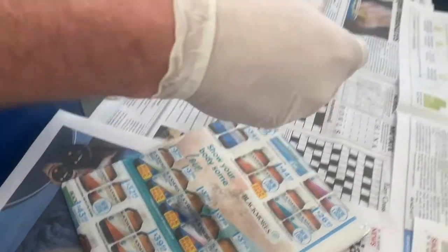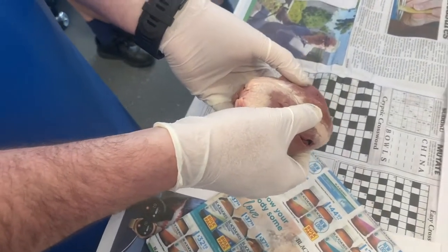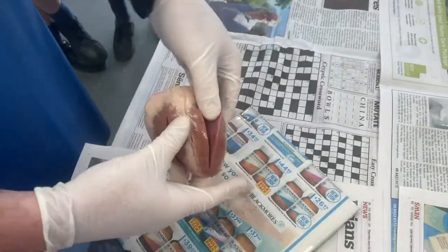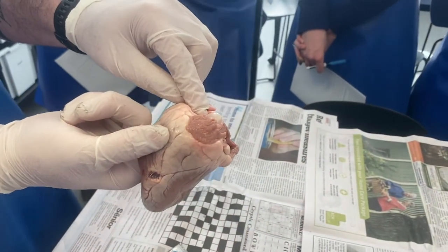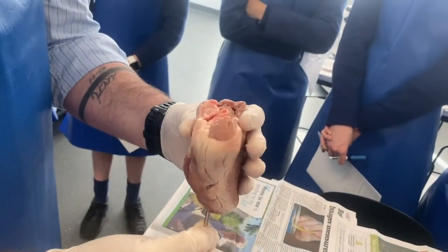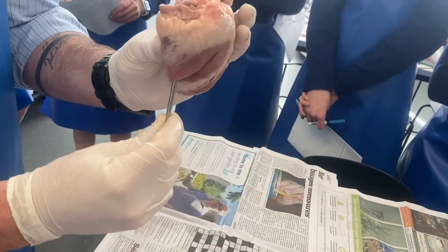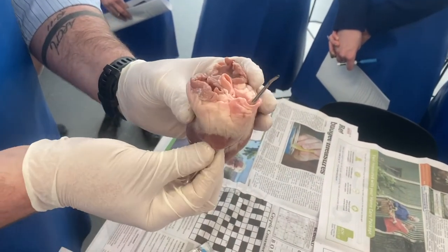Once you've cut it, you'll automatically notice a difference in thickness — see how thin that wall is compared to the other side. Think about what each side does: one pumps to the lungs which are nearby, the other pumps all the way out to your toes, so it has a much thicker wall. By exploring, what you should find going in from the right side is your pulmonary artery — that's the one going to the lungs. From the left side, you should be able to find your aorta. Note that the atriums are cut off in this specimen, so you won't find the vena cava or pulmonary veins. Use your probe to navigate — you can go up through the atrium and out through the aorta or pulmonary artery.